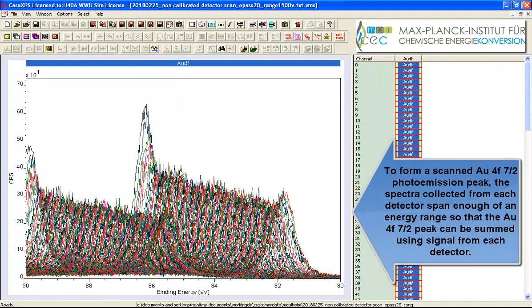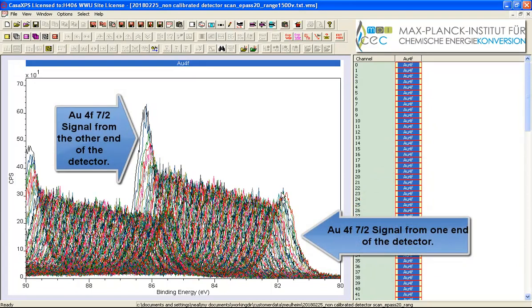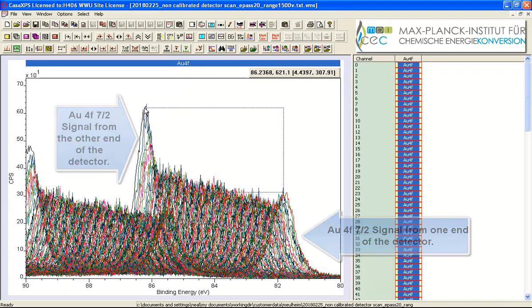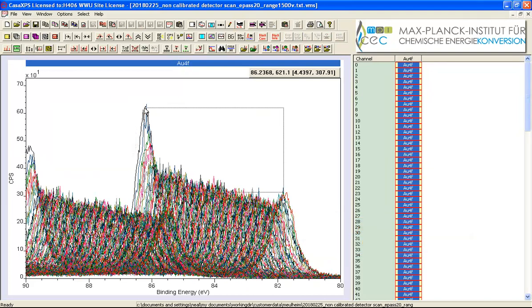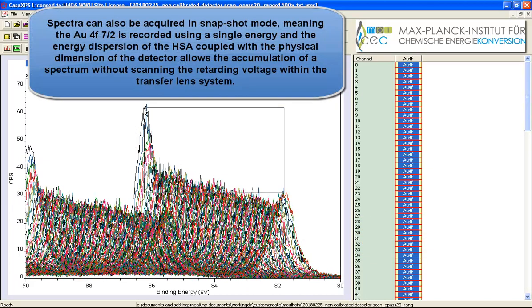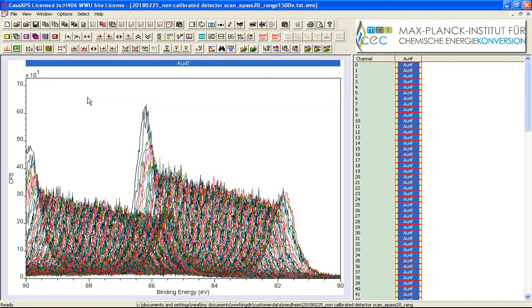And you can see that these spectra all have shifted doublet peaks so we have a range of different energies for this 4F7 halves peak and it's about 4.5 electron volts. This is not a charge compensation issue. This is a property of the hemispherical analyzer and the detection system.